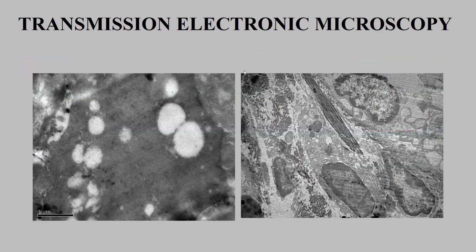In some rare cases, probably mostly for science use, electron microscopy. An example, transmission electron microscopy. In this case we can see some vesicles, calcifying vesicles in atherosclerotic plaque, or connective tissue produced by fibroblast, and some changes in thyroid gland.